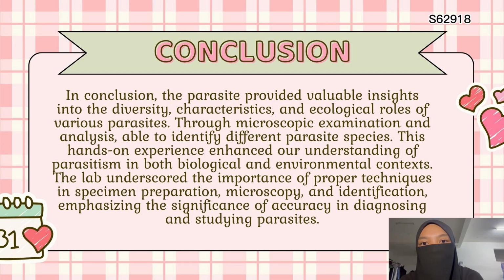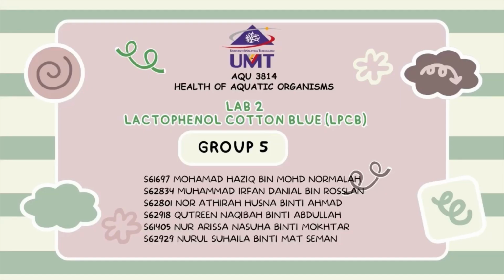In conclusion, the lab provided valuable insight into the diversity, characteristics, and ecological roles of various parasites. Through microscopic examination and analysis, we were able to identify different parasite species. This hands-on experience enhanced our understanding of parasitism in both biological and environmental contexts. The lab underscored the importance of proper techniques in specimen preparation, microscopy, and identification, emphasizing the significance of accuracy in diagnosing and studying parasites.